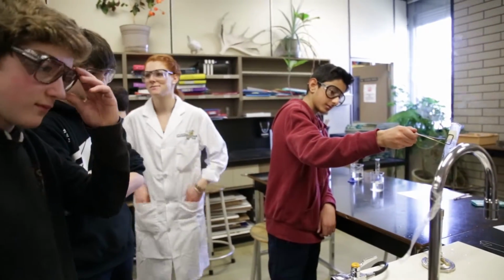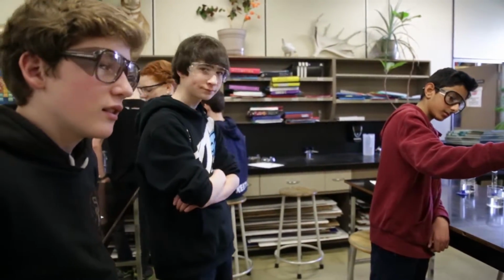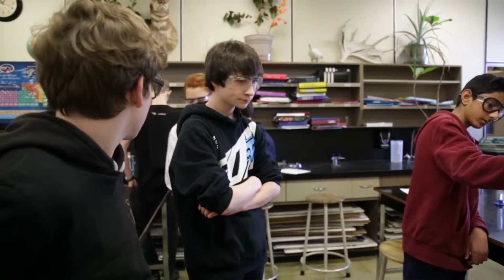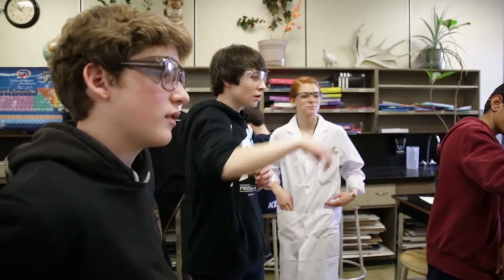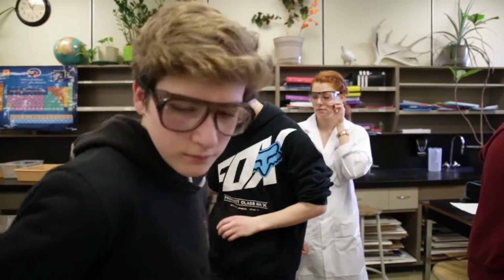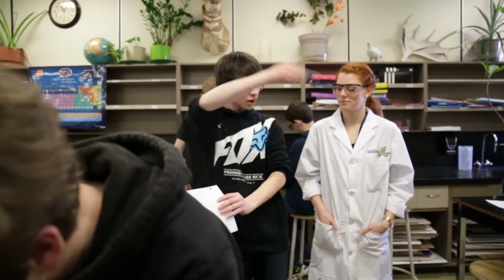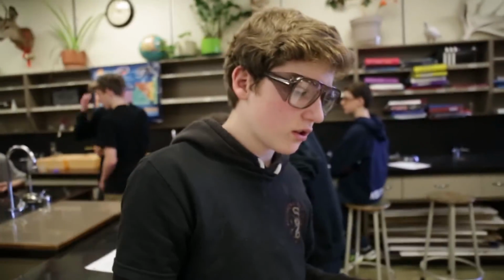One of them spits. Which one spits? B. B? Really? Not A? No. A was kind of all over the place, but it wasn't shooting out like B. Okay, good observations. Did you write that down? I wrote that B exploded. It shot. It started fizzing right away, and then it quickly boiled.